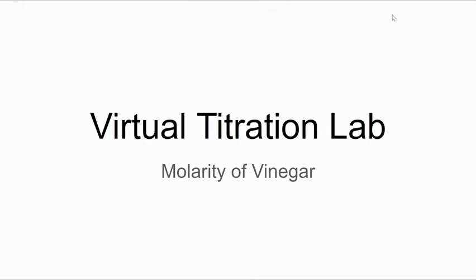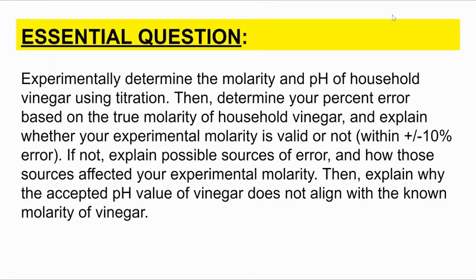Good afternoon. This is the virtual titration of vinegar lab. I'm Miss Mikesell, and I'm one of the chemistry teachers at Eagle Crest. Our essential question for today's lab is to experimentally determine the molarity of household vinegar using a titration.